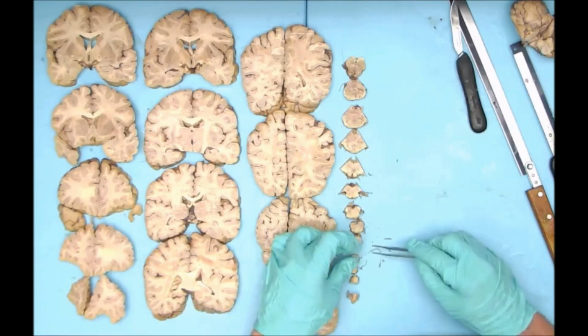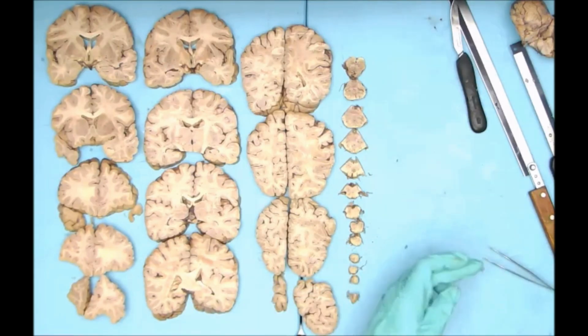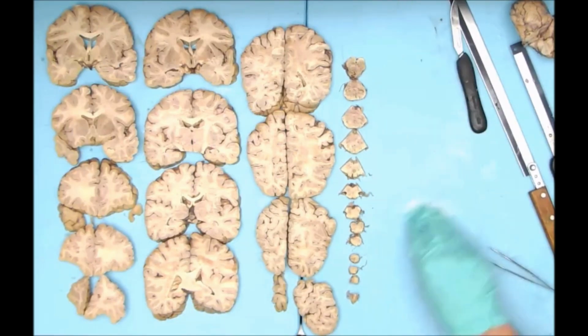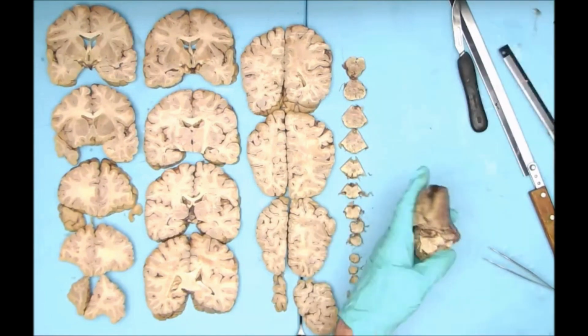So there we have it, from the substantia nigra down to the medulla in a sequential fashion. Kind of cleaning up my cutting board as I move on to the cerebellum.